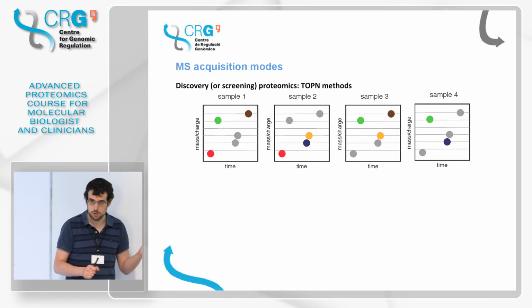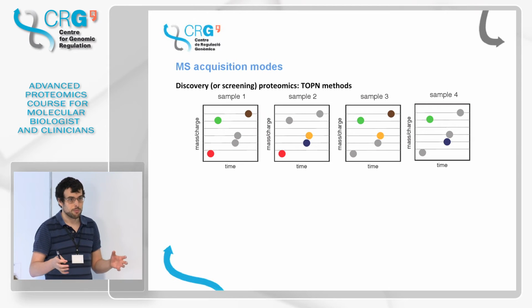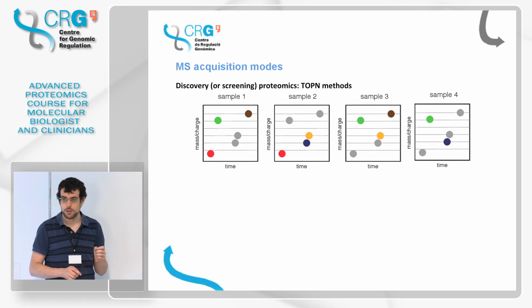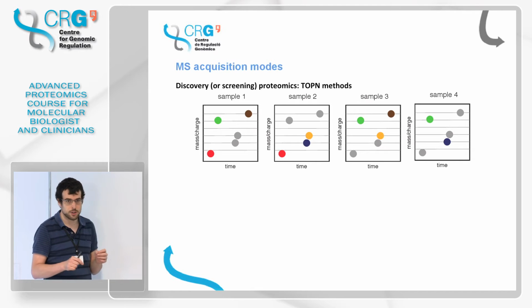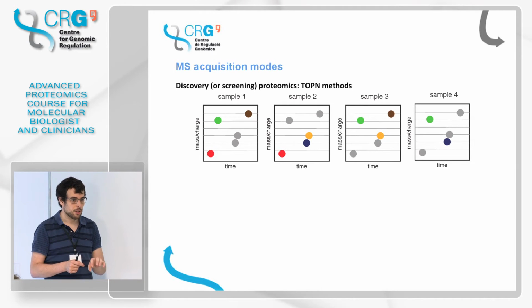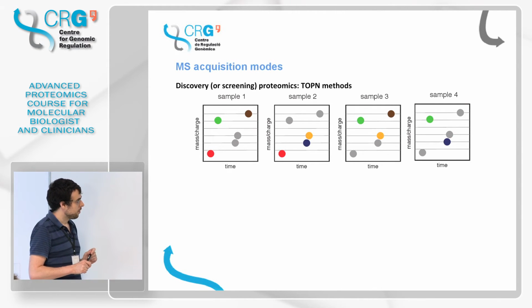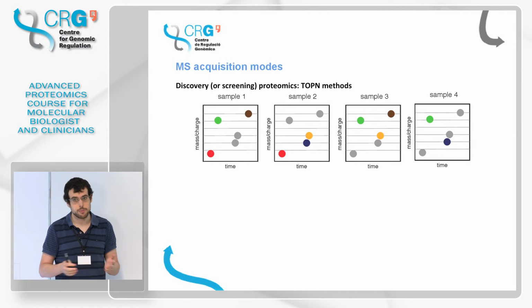This is very easy to do manually, right? But given the amount of analytes, we cannot do it manually, and we have to do it computationally. And computationally, when you are dealing with thousands of analytes instead of 5 analytes like here, it is not so easy to implement so that computers can do it in a proper way. This is something that we normally do in many workflows, but depending on the sample, it's not always the best solution.